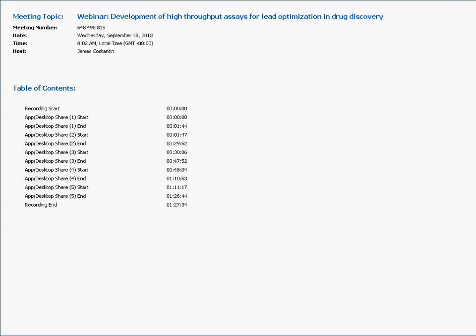This is how the data is visualized. The sweeps are acquired, and the differences between cursors are plotted into a current trace chart. This is essentially an IT plot. 64 sweep recordings are recorded simultaneously because we have 32 individual patterns, and each pattern has two traps. So that gives us 64 individual recordings. And the trace state is plotted one zone at a time. A zone consists of one quarter of the plate, or 16 channels. So you can view 16 channels overlaid at a time.